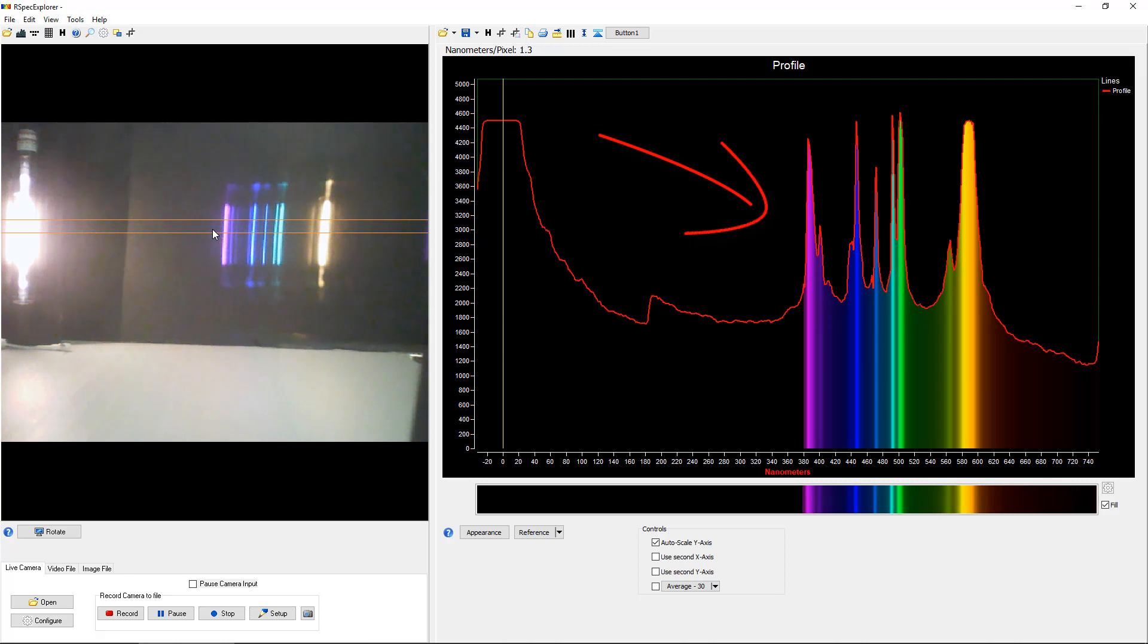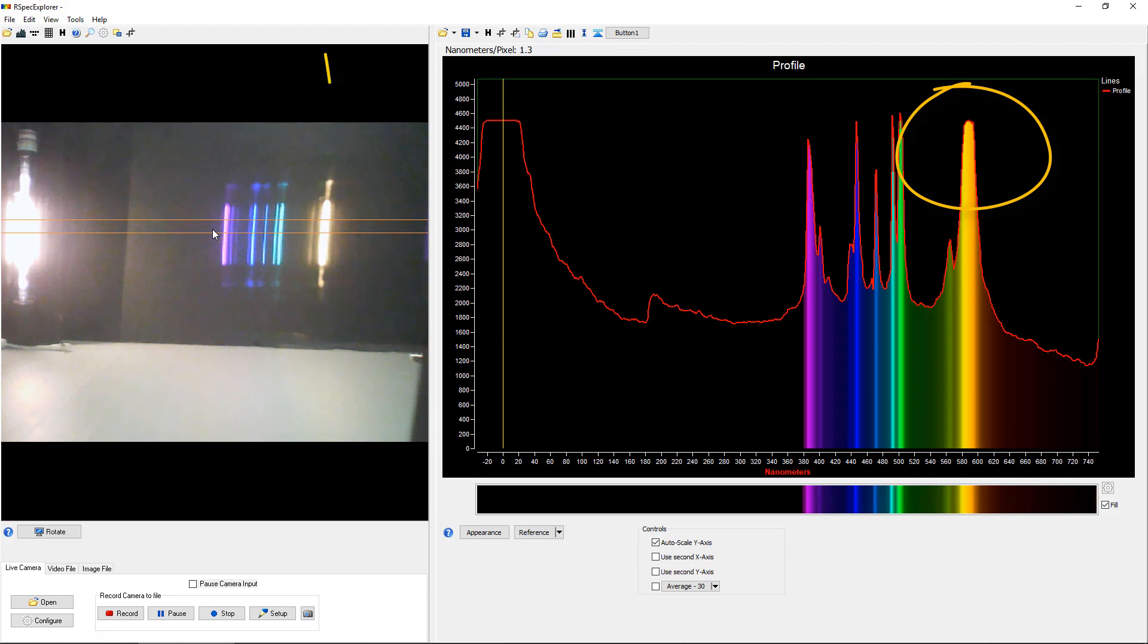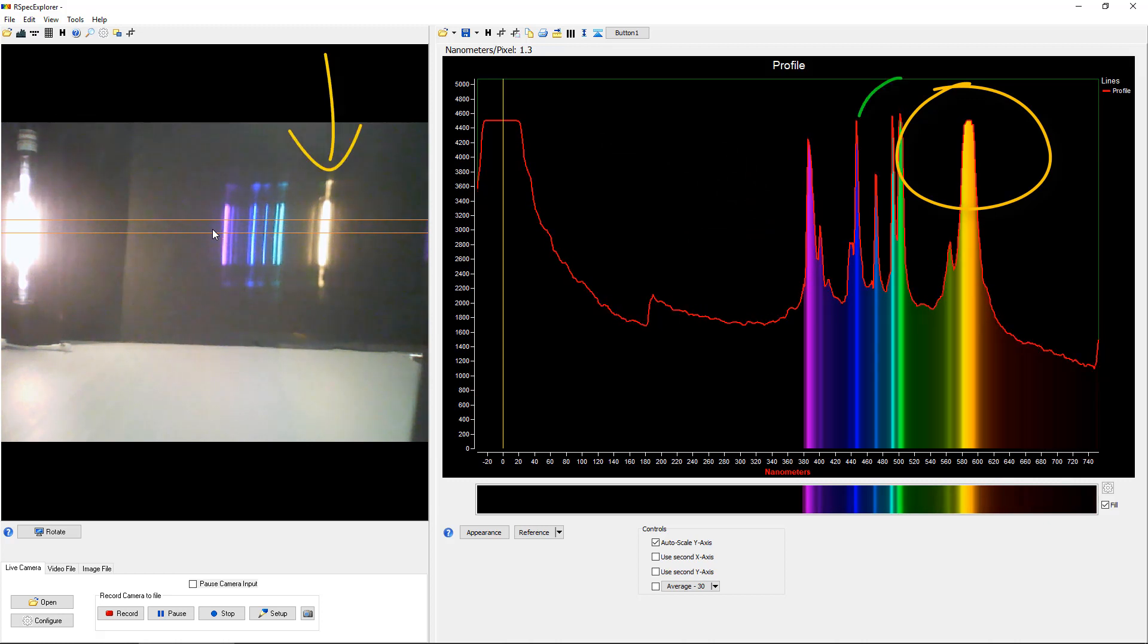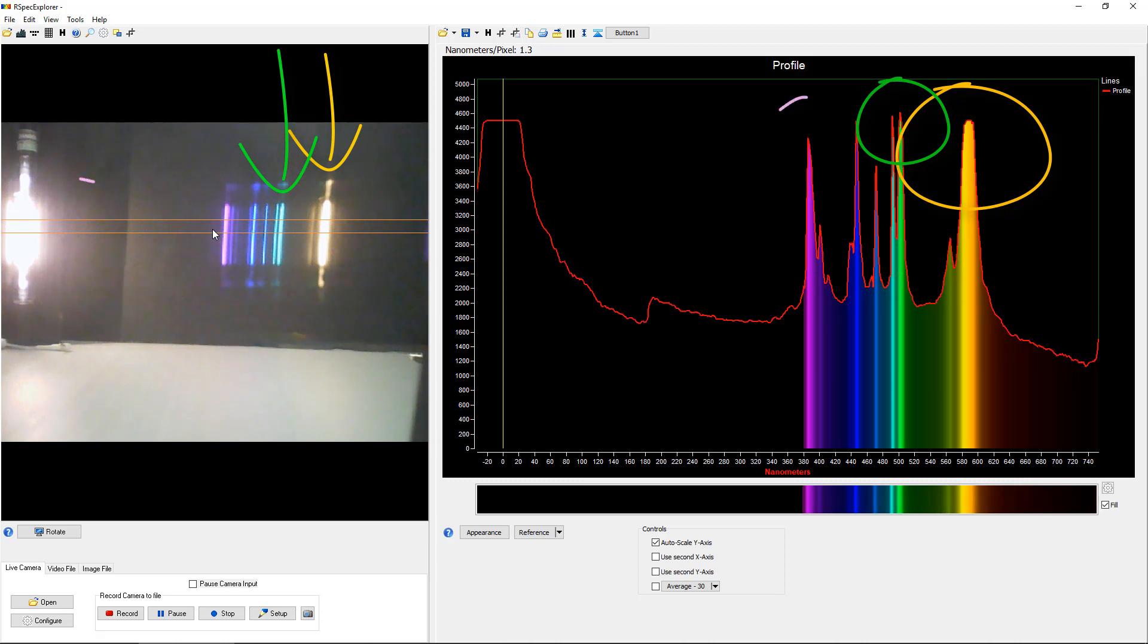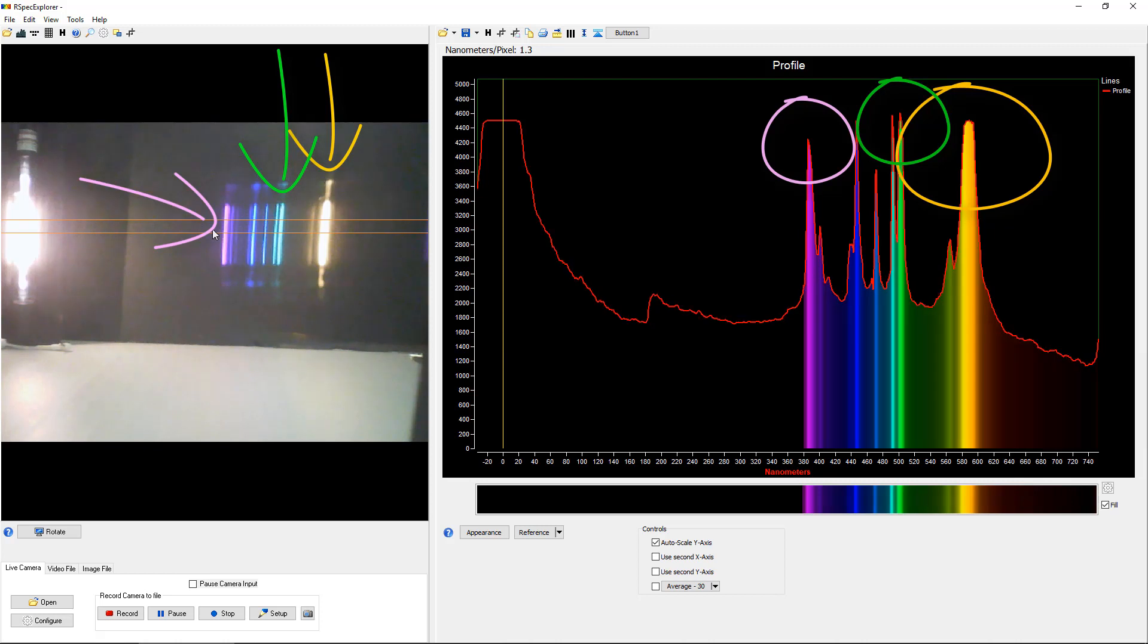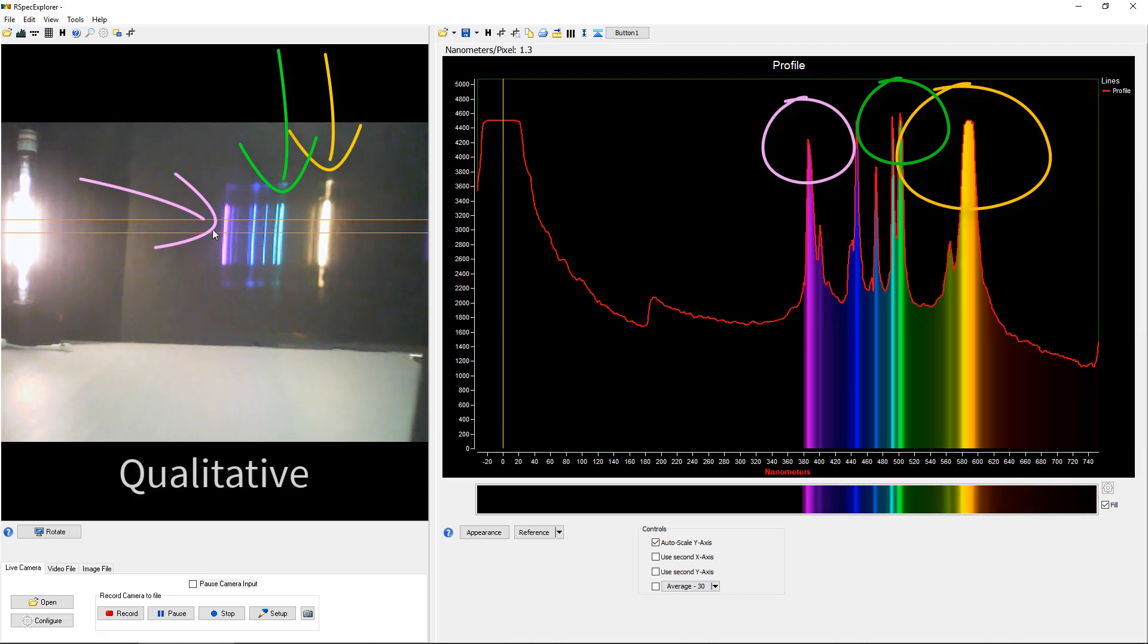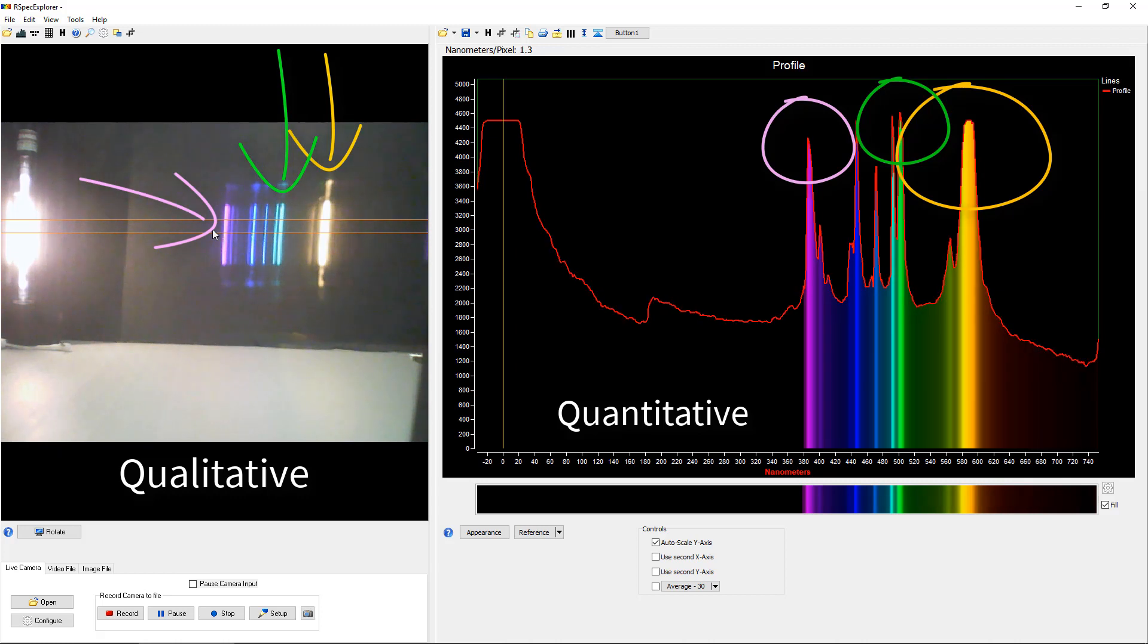So looking at this graph, we can observe with the students that this yellow peak here is that yellow peak there. And that this greenish doublet here is over here. And so forth with the purple lines and the others. This helps again the student understand the relationship between the qualitative data on the left and the quantitative scientific representation on the right.